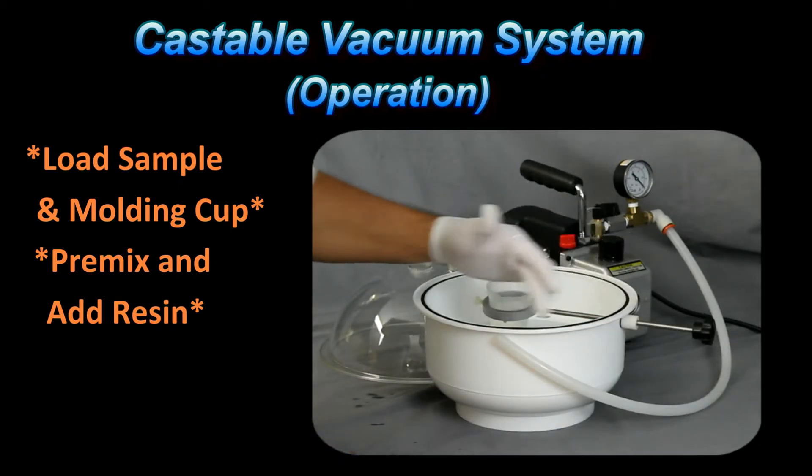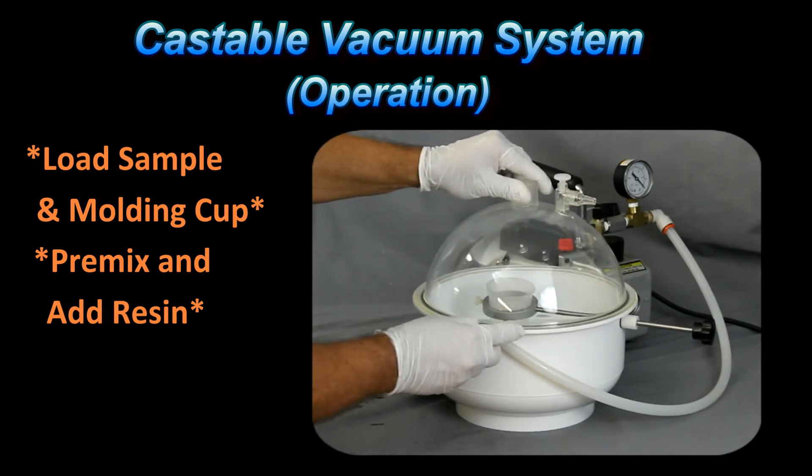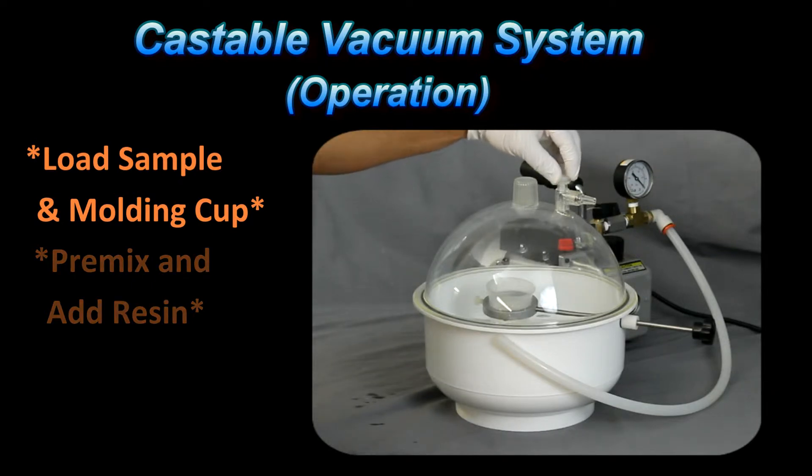Make sure the gasket is in place, then put the cover on. This release cock valve here — we want to make sure that it is snug but not too tight. What we want to avoid is this coming off too fast when we're increasing the pressure after we pour the resin over the specimen. If we do that, the increase of pressure is going to cause the resin to splatter and create a mess.